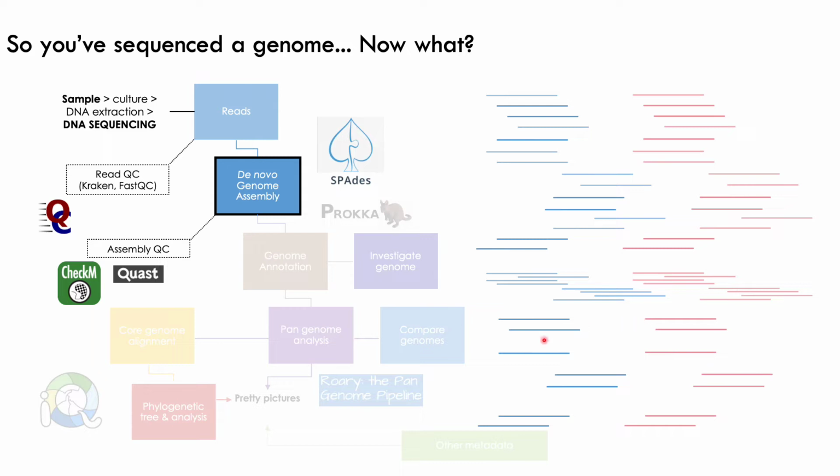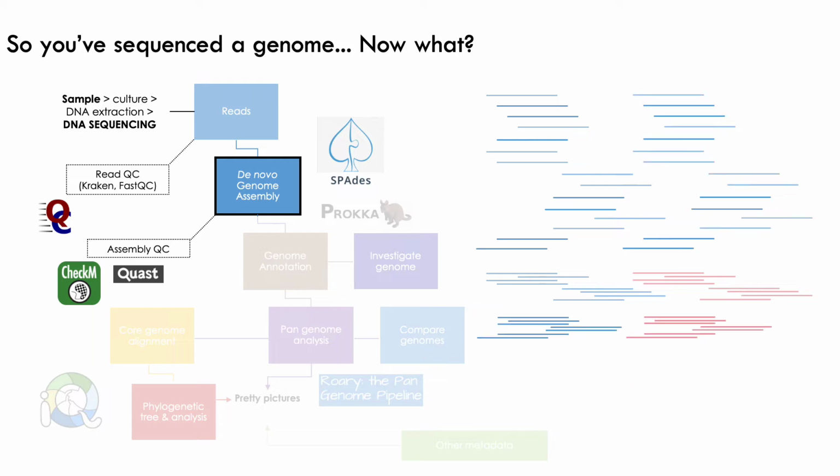Let's then take our dark colored or dark shaded reads, again forward and reverse. We'll do the same thing, we'll align them to each other. And what you can see is that there is overlap, but we do actually have a little gap here, a little break. And so what the assembler will do is that it doesn't know what to do in this region, so instead of one contig as we did with the light shaded ones, we've got two contigs.